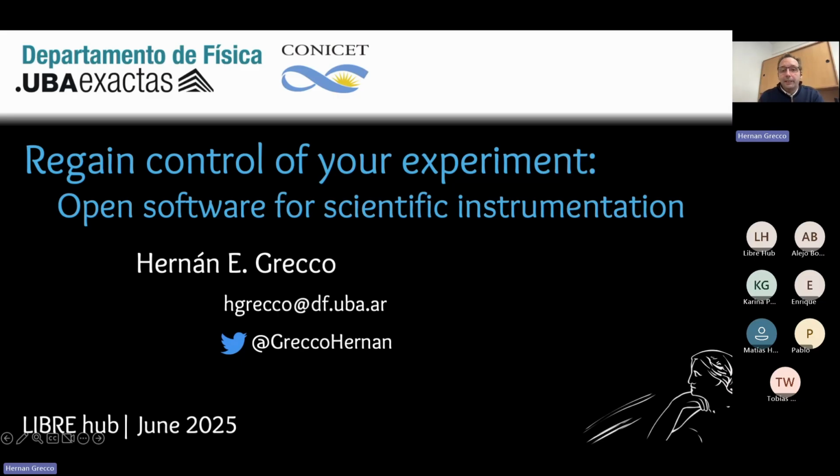The seminar is going to be in English, but if you would like to ask questions, feel free to do it in Spanish. Today we will explore what the line between software and hardware is and how it is disappearing, and how in modern experiments we need to depend on software to orchestrate complex procedures. I will share a little of my experience building open source software and also building open source experimental devices.